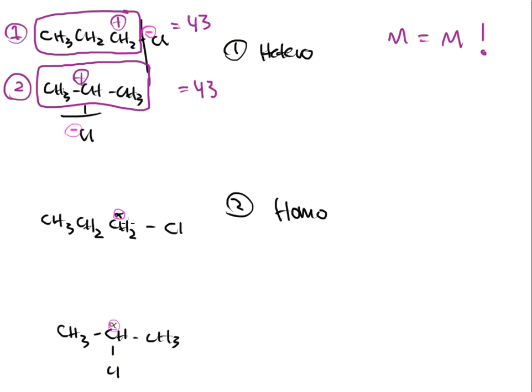So homolytic cleavage for these molecules means that I'll look at the alpha carbon, and at the alpha carbon, I'm going to break a bond. Well, this one only has one bond for me to choose from, and that's here. That bond will cleave. The one down here at the bottom, we've talked about this before. The left hand is the same as the right hand. It will both spit off a CH3 in either case. Really doesn't matter. I'm just going to draw one option here, and I'm going to cleave that bond.